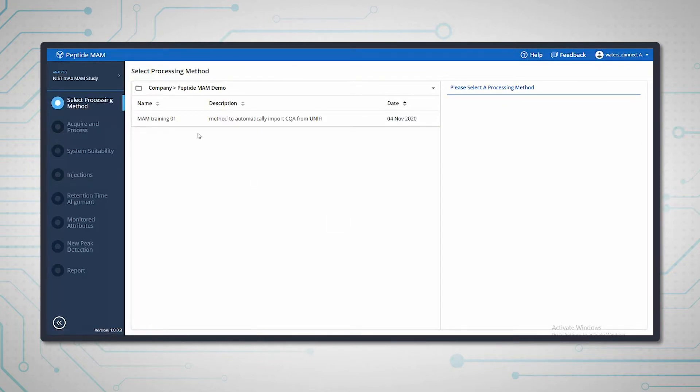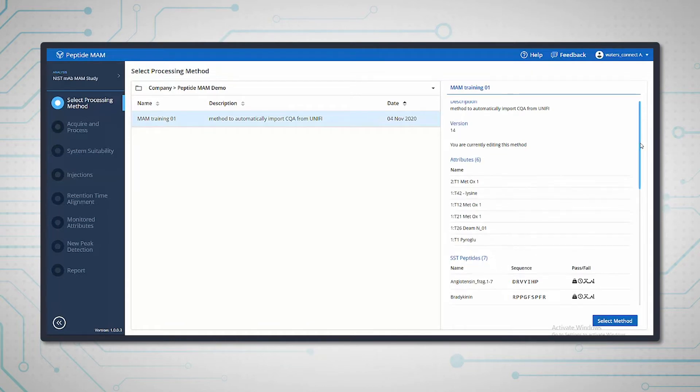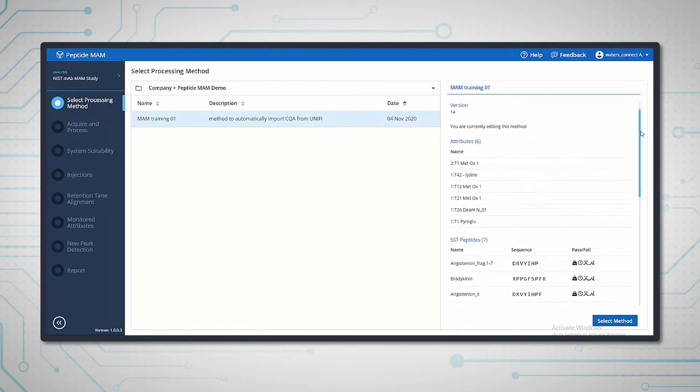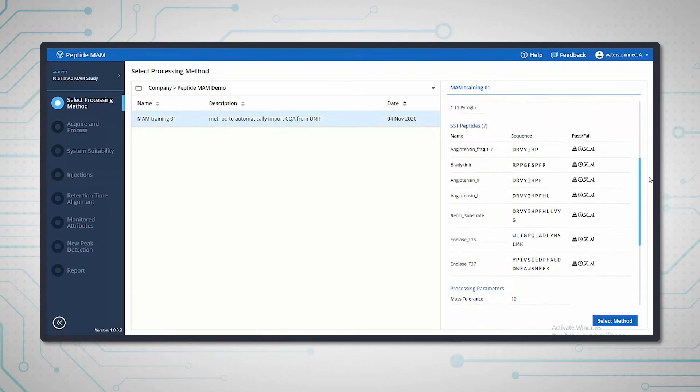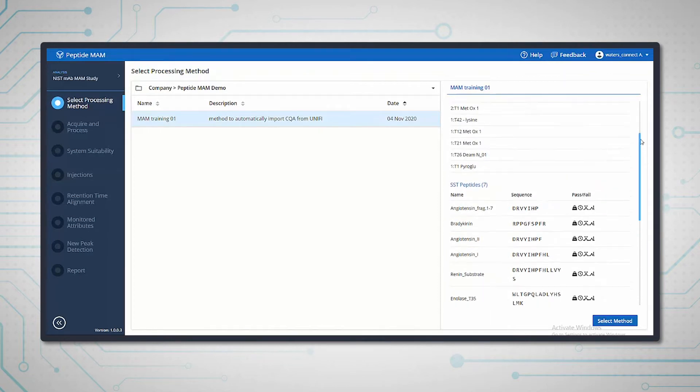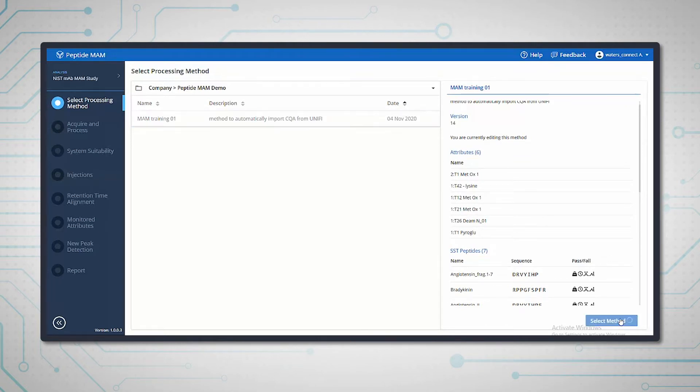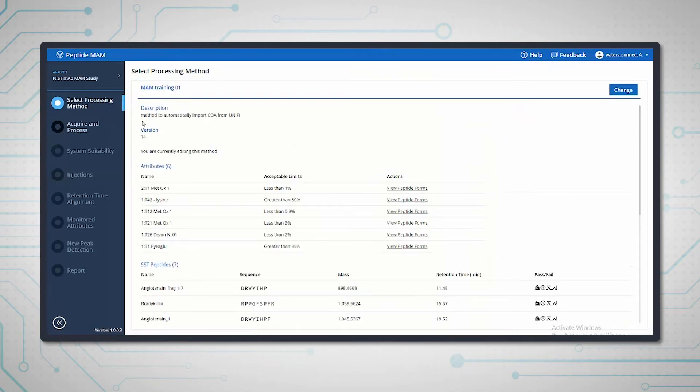The first stage is to create the processing method. This is the method we were just looking at in the first section. By selecting the method, we can see on the right-hand side of the screen the key parameters. We can see the SST peptides and the six different attributes that were specified in the method. Once we're happy with the method, we select it and move to the second stage.